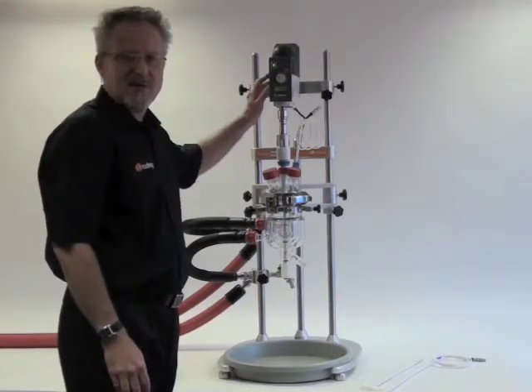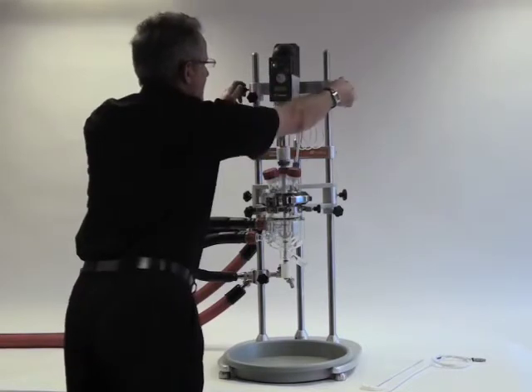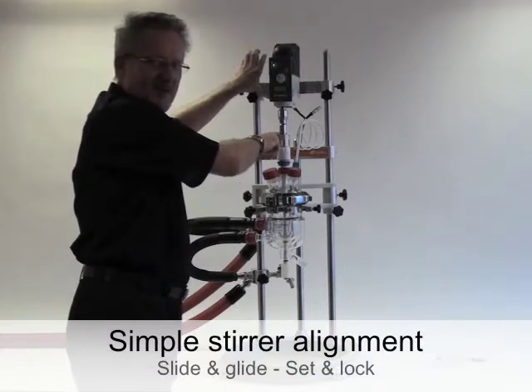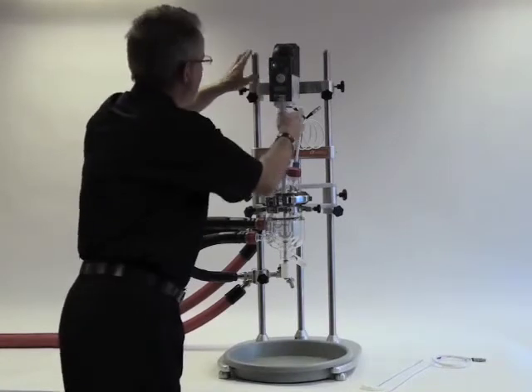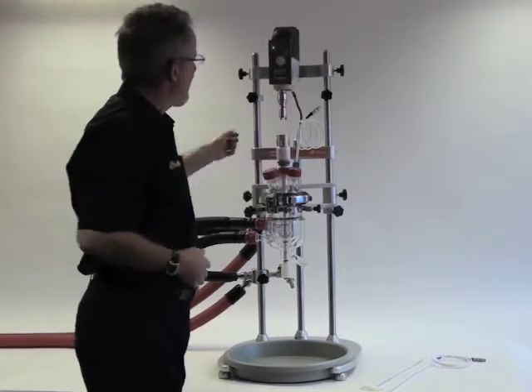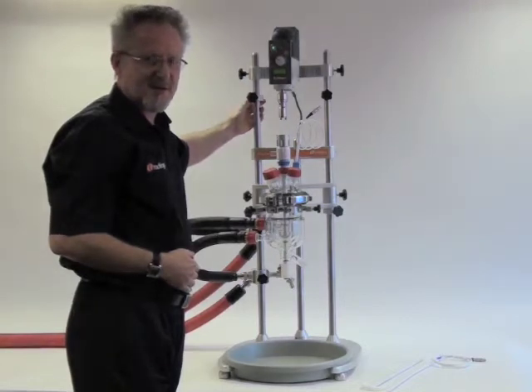First I'd like to remove the overhead stirrer out of the way. You'll note that the drop-in stirrer coupling disengages without the need for tools and the stirrer is supported on this I-beam. These safety stop collars allow the I-beam to return to the correct position each time.